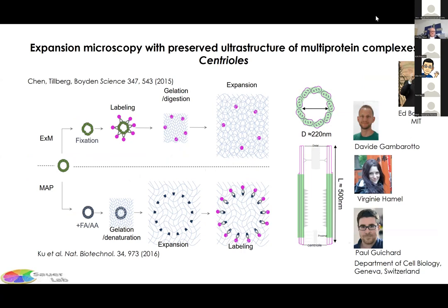Immediately after this first paper, we tried to join forces together with Ed Boyden and another group in Geneva, Paul Guichard, Virginie Hamel, and at that time postdoc Davide Gambarotto. These people are experts in cryo-EM, so they usually work with purified centrioles. And we thought about whether expansion microscopy can be used to isotropically expand such delicate or complex multi-protein complexes like the centriole, while preserving their ultrastructure.